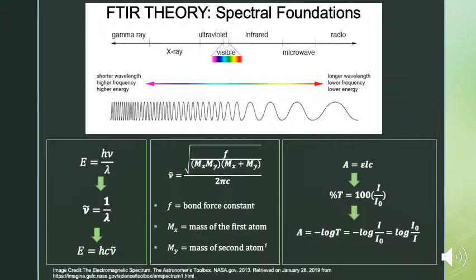Now, as is typical in spectroscopy, the relationship between wavelength and energy is integral. In FTIR, the key factor is the reciprocal relationship between energy and wavelength, which translates to a direct relationship between the wave number, which is the IR spectral function on the x-axis, and energy. What this means practically is that the bands of high wave numbers on the spectrum have higher energy, while lower wave numbers correspond to lower energy.